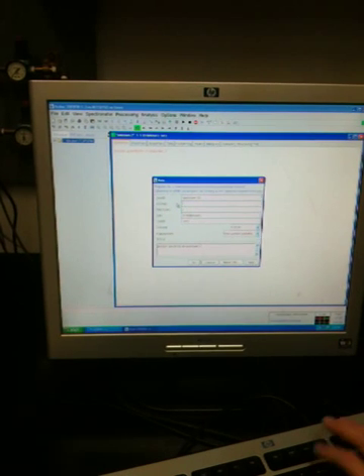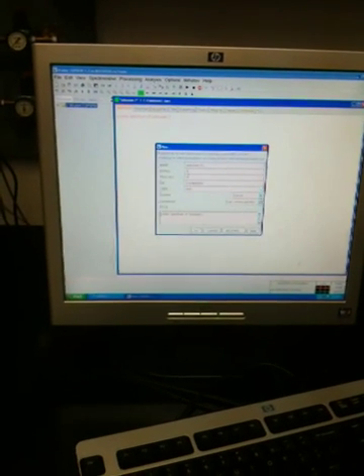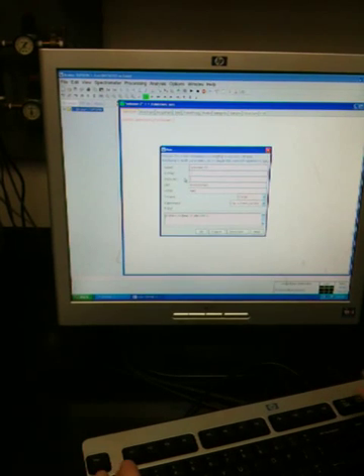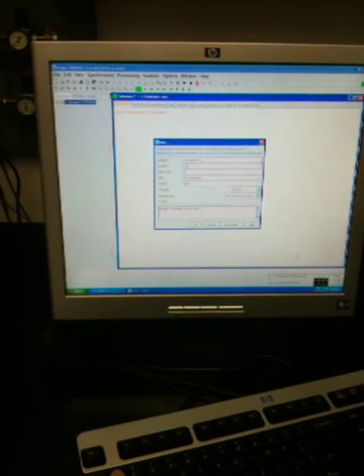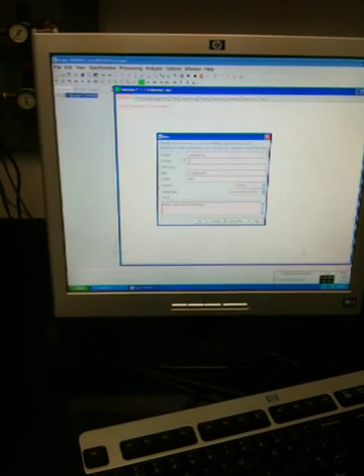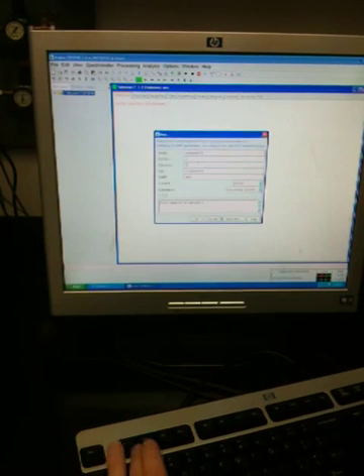You'll have some experiment number that you'll be instructed to put in. I'm putting one on both. Well, I'll make this two, actually. Two, because I'm on my second experiment of the day here.